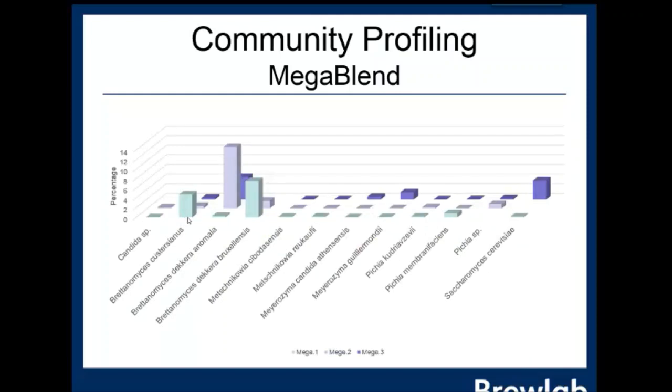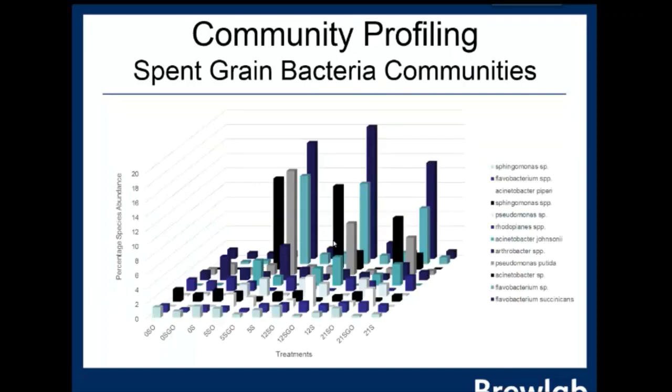We did the same with the yeast from this group, so we looked at the presence of different yeast. We've got Brettanomyces here initially in the groupings, less so Saccharomyces, a couple of Pichia samples, but towards the end of the fermentation we do get Saccharomyces being fairly dominant in the system, as we might expect.